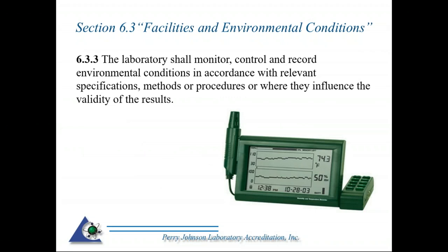6.3.3, the laboratory shall monitor, control, and record environmental conditions in accordance with relevant specifications, methods, or procedures, or where they influence the validity of results. So we have monitoring there. Perhaps your environment needs to be stable over a period of time. You can see any fluctuation within a set period. Typically a data logger is something where you can go back, starting your day's activities, just to assure that the environmental parameters have been stable before proceeding.